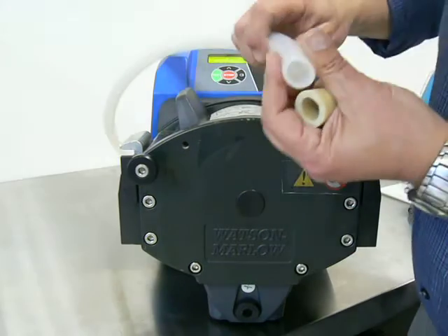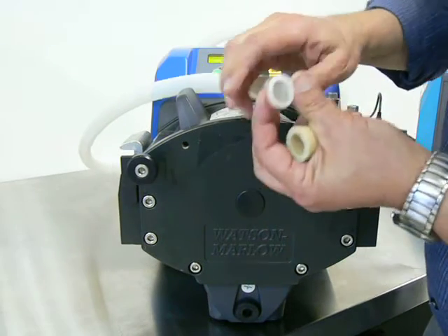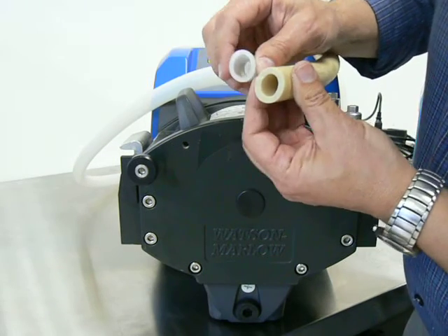Here's an example of different wall thicknesses. This tubing is 3.2mm wall thickness, or 1/8 inch. You can see the difference between 3.2mm and 4.8mm.